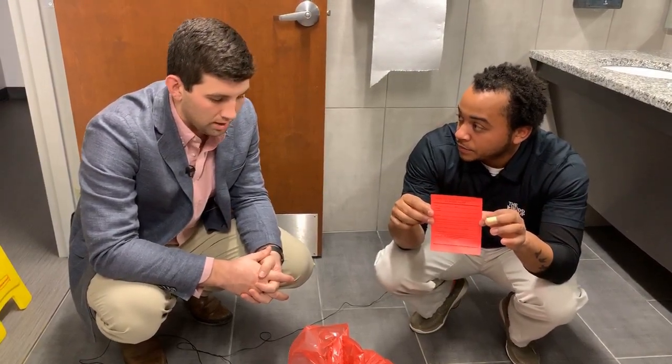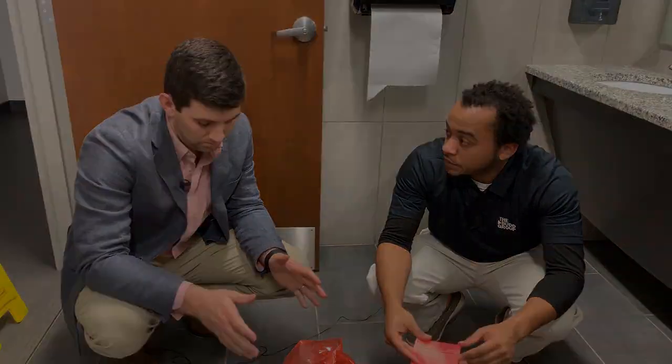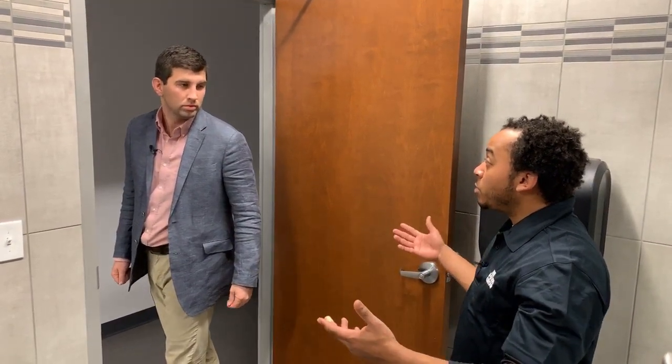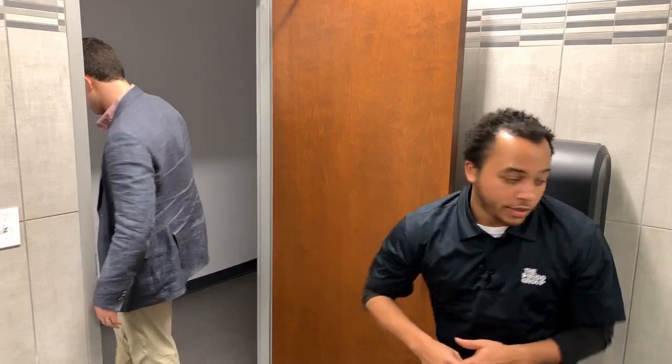Awesome. All right. Well, very good. Let's go debrief back at your office, if that's all right. That sounds great. All right, man. Hey, anytime the last step when you're cleaning up a blood spill, blood-borne pathogen spill, you got to wash your hands for 30 seconds. So I'll meet you at my office. All right? All right. Sounds good. Sounds great.